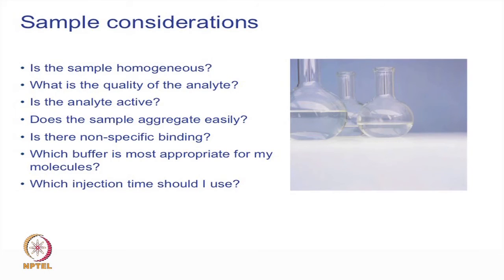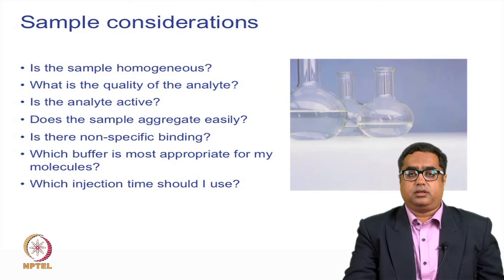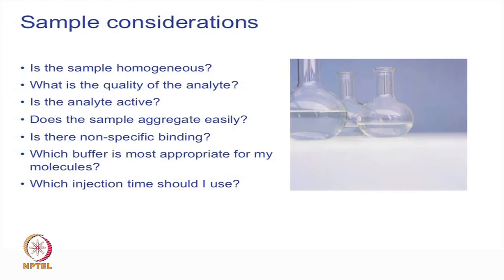The sample or analyte is a major contributor to bad data. It is very important to purify and characterize them before experimentation. Homogenous samples are required — please make sure samples are highly homogenous, good quality, active, and do not aggregate or cause non-specific binding. It is also important to understand the right buffer for a given sample and to identify good sample conditions before setting up Biacore experiments.